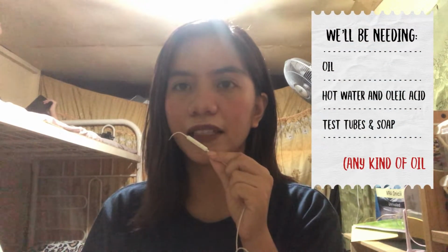For our first experiment, it is called the emulsification of fats and oils. So we'll be needing coconut oil, corn oil, margarine, oleic acid, and detergent or soap.